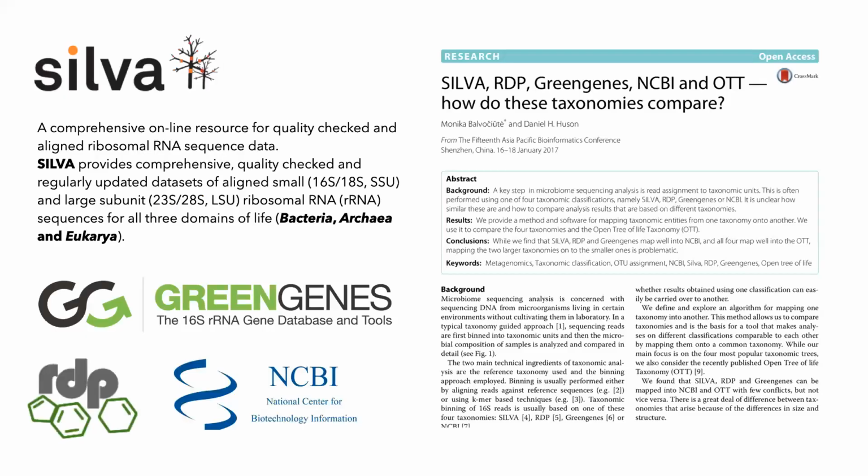Okay, and then the records of those individual sequences are organized in different databases. So what are some of these databases? SILVA, RDP, which stands for Ribosomal Database Project, right? People actually annotate these sequences when they appear in real life.